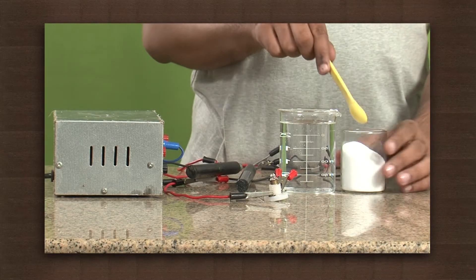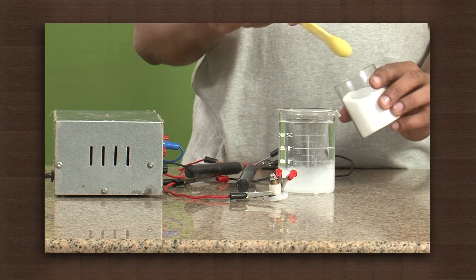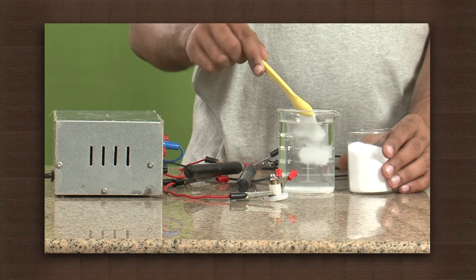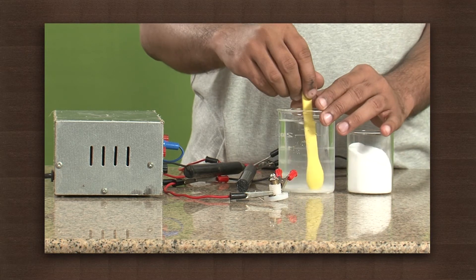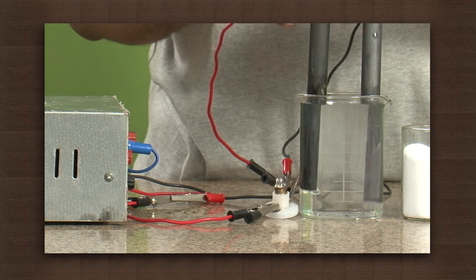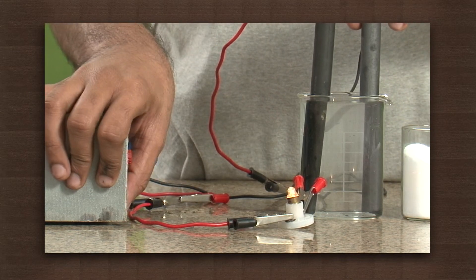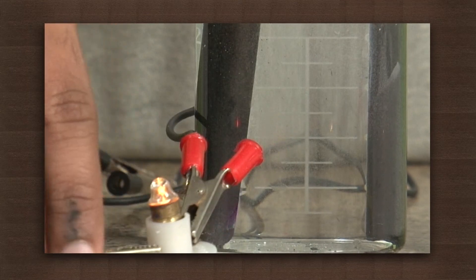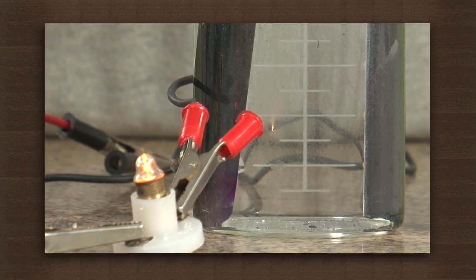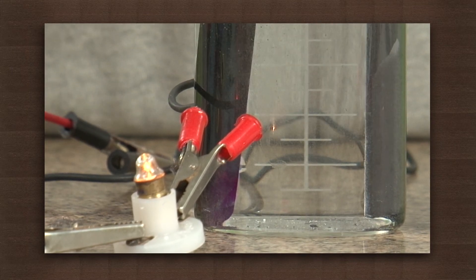Now switch off the circuit and add some salt to the water in the beaker. Stir till it dissolves completely. Insert the electrodes just like last time and switch on the circuit. We see that this time the bulb glows — the salt solution conducted electricity. This proves that pure water is a non-electrolyte and the salt solution is an electrolytic solution.